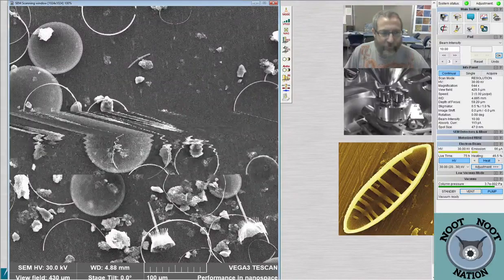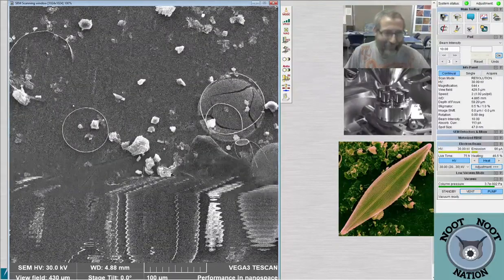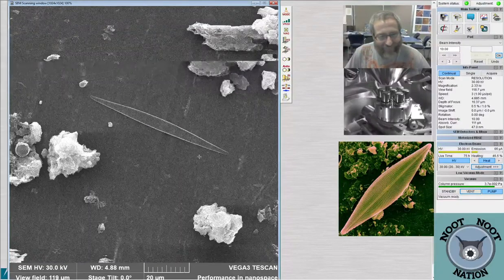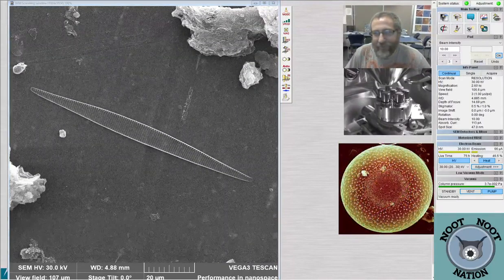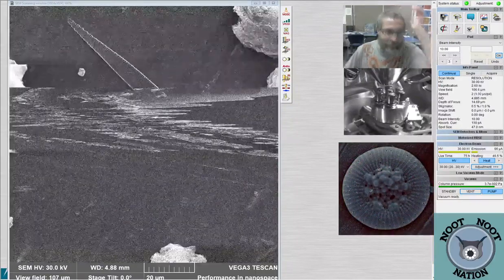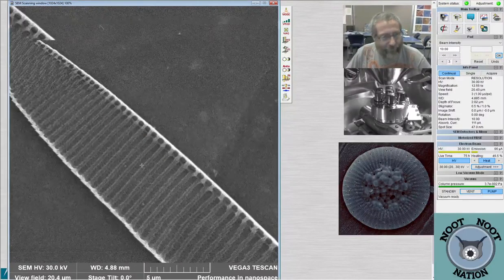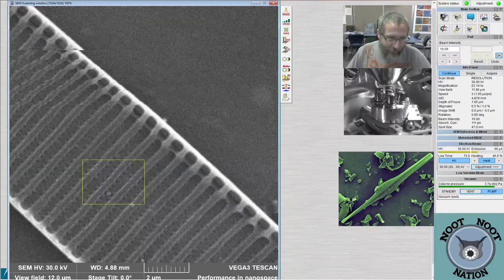It's our landmark. We can divide up the slide by above and below. Oh, yeah. The half of it that is under there and the half that isn't. Yeah, this one looks like it would be a good candidate. Let's see. It does. Which way do I want to turn it? Pseudonitzschia. I guessed correctly. Every time I do it, I forget which way is which. Which way is clockwise.